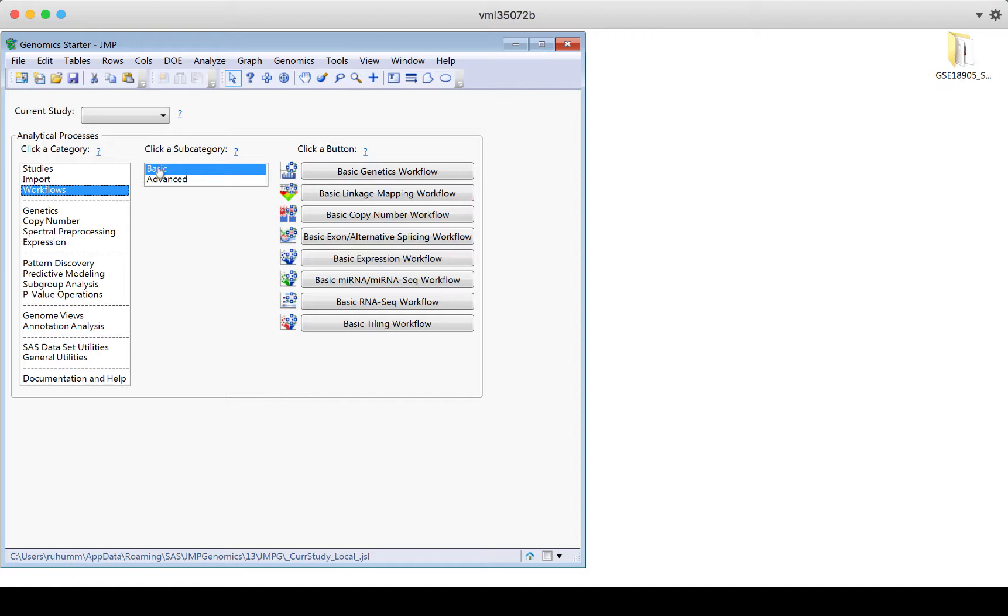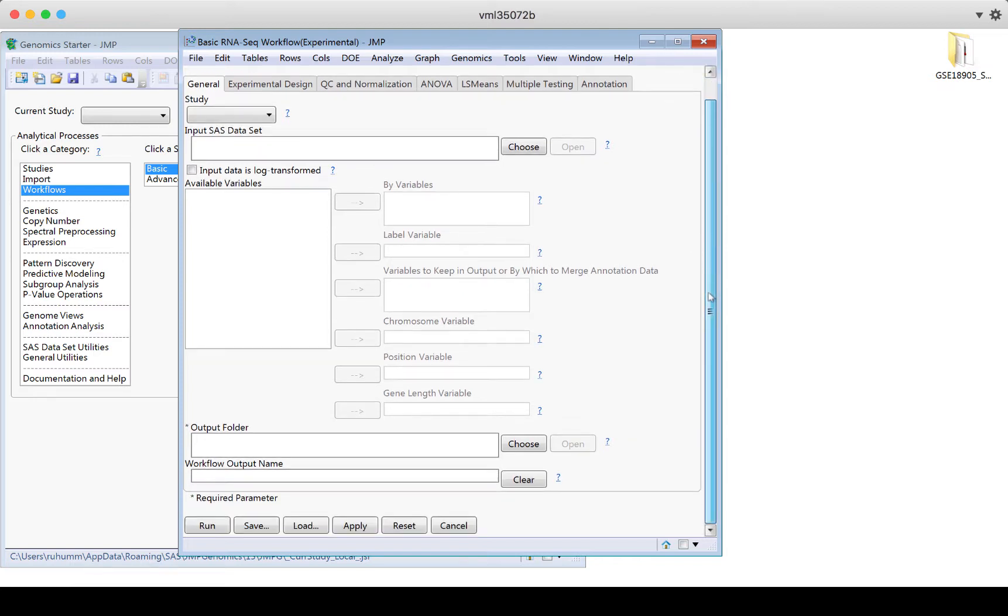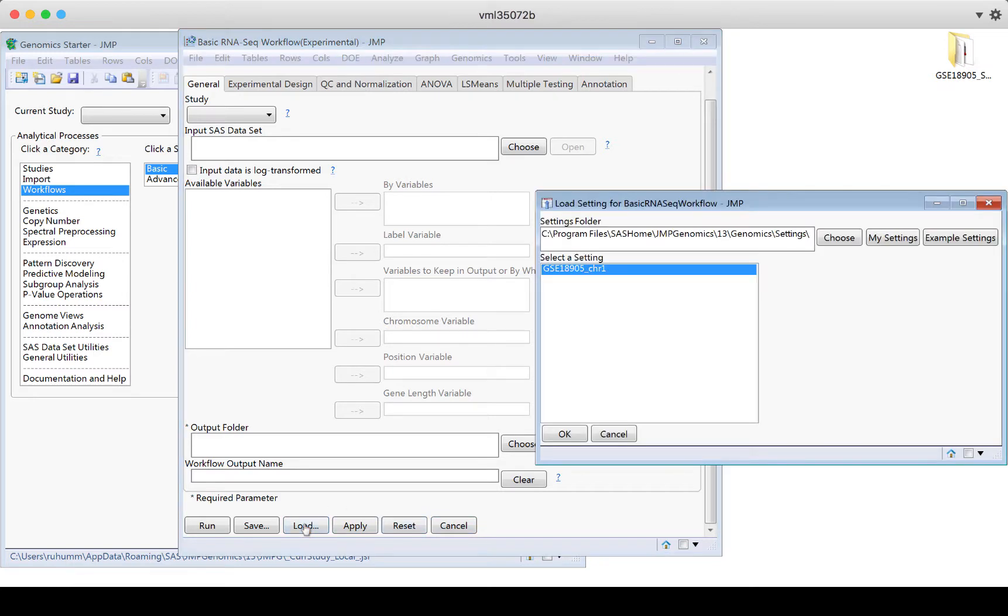So in the workflows, if we look at the basic workflows and we use this basic RNA-seq workflow, this is the workflow I would use for the mouse data experiment we were looking at. And if I'm not ready yet to get my data in, I just want to play around with JMP Genomics and see what functionality is available here. If I scroll to the bottom of any of these process windows, you'll see these run, save, load, apply, reset and cancel buttons. If you click on load, this is going to give you an option for an example to play around with.